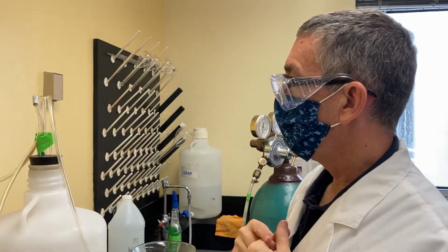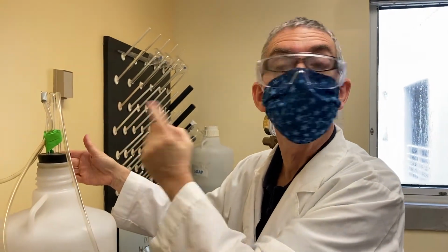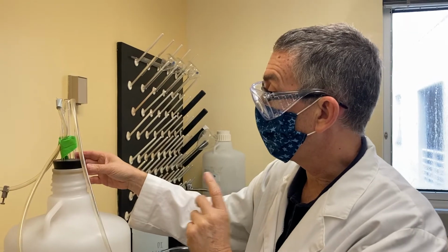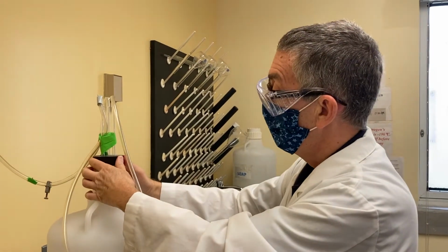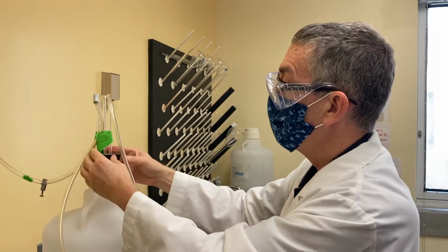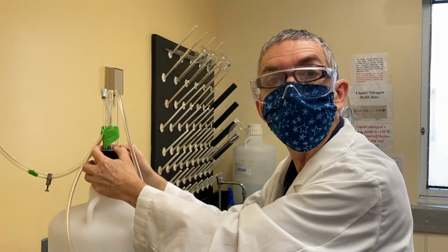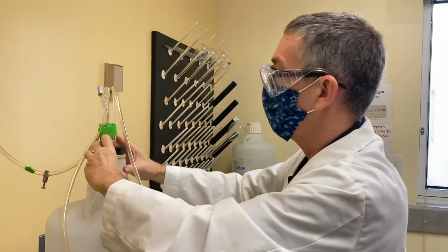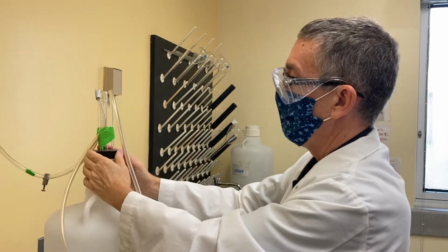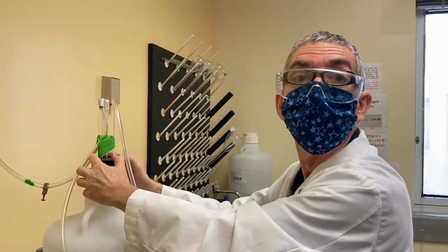One critical part of the experiment will be when you have to raise and lower the stopper. So a couple of things about that. I recommend that you practice. After you have a positive pressure in here, you will lift this a couple of inches and replace it. It's just like that. And after you replace it, make sure it's in tight. Now this motion is important.